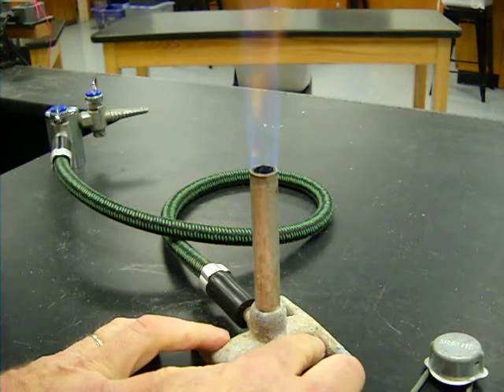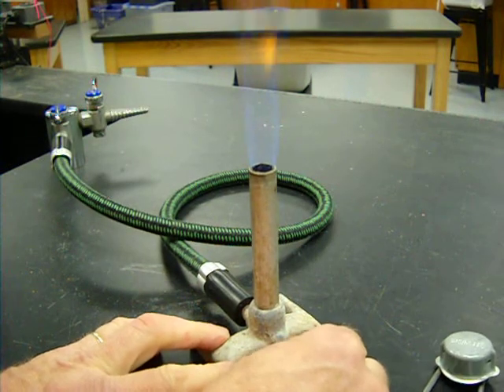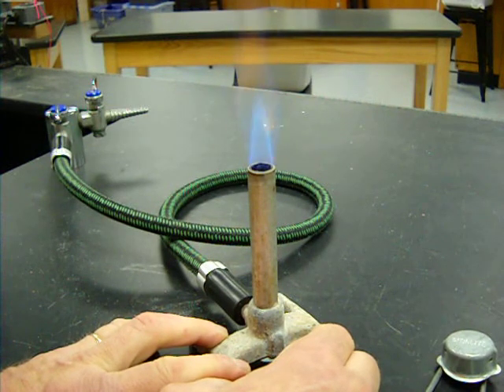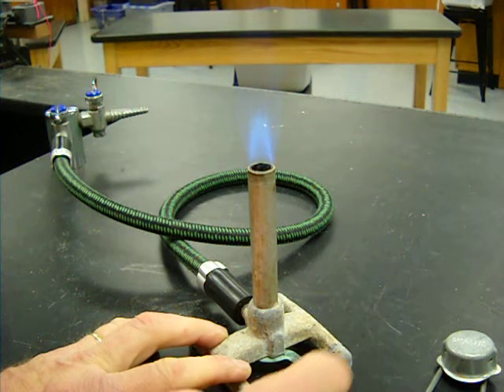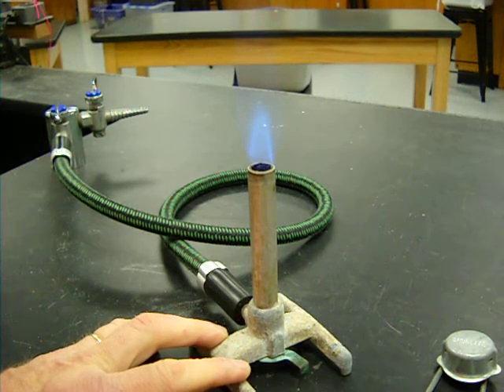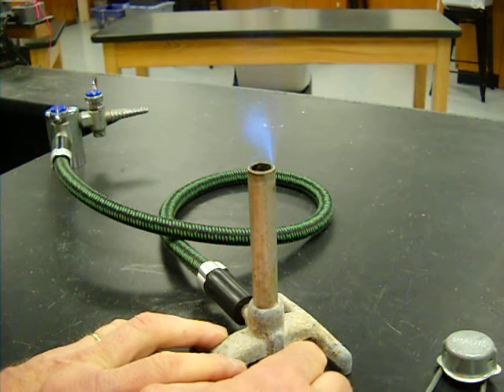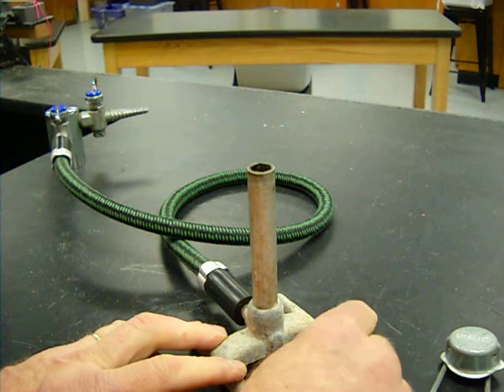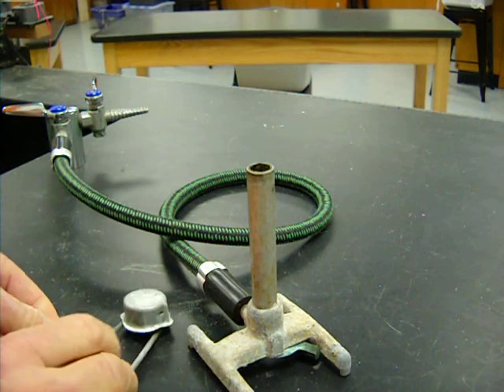I'm going to add a little bit of air by opening up the valve at the bottom. Please make sure you know which way to open and which way to close. As I add more air, you can hear it become more turbulent. In fact, if I keep just adding air, the flame will go out. It will blow itself out. Let me shut that off, turn the gas off, get ready to go again.